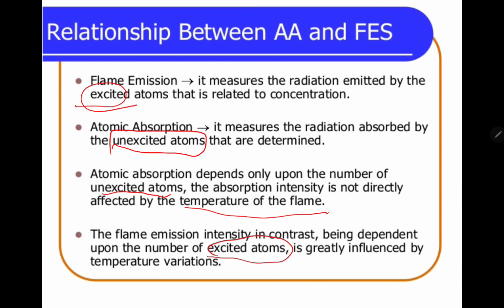So that's why guys, flame emission spectrophotometry is no longer commonly used. Aside from being hazardous, when we use a flame, there are certain factors to consider, because the temperature can influence it. Here you are measuring the excited atoms, excited electrons, but if the temperature is too high, the flame is too great, there will be lots of excited atoms, right? So it could lead to a misread of your result.